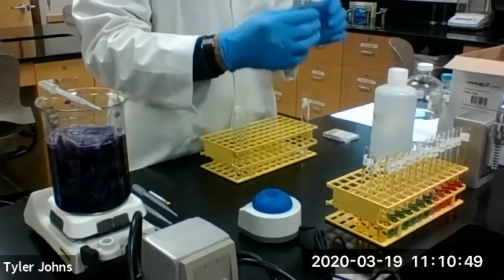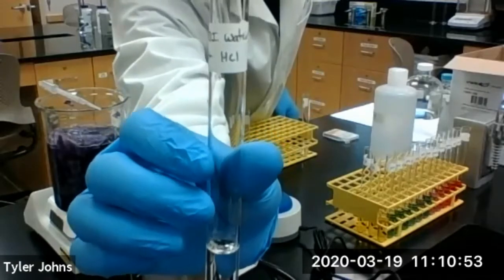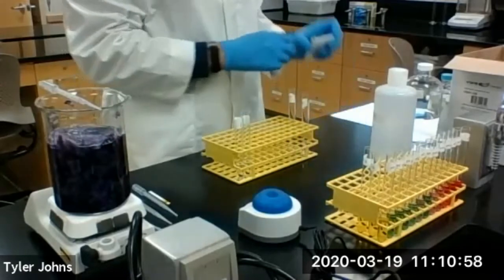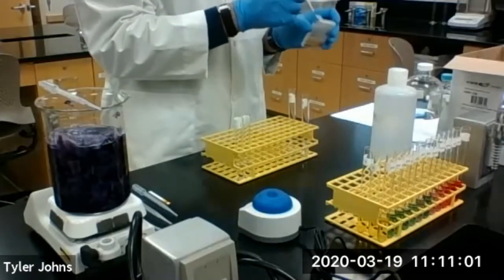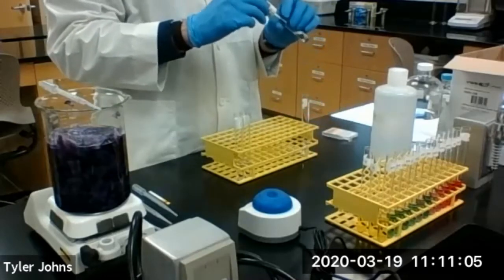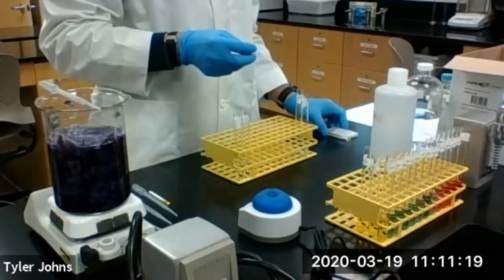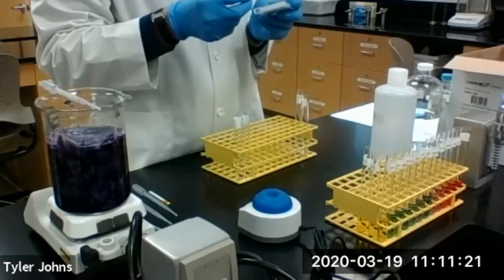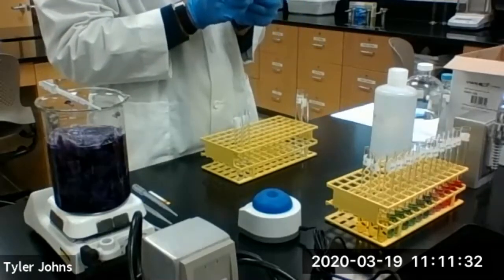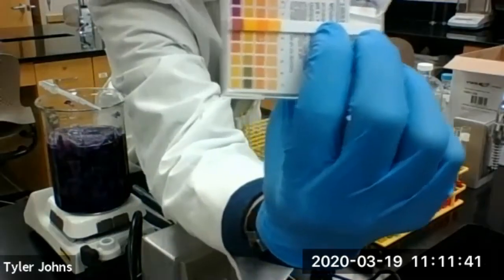Okay, so we're going to start with our deionized water plus hydrochloric acid. And we're going to use the litmus paper to check the pH of the solution, to see how it has changed after the addition of the hydrochloric acid. So after the addition of the hydrochloric acid, this is now the pH of our deionized water plus the hydrochloric acid.